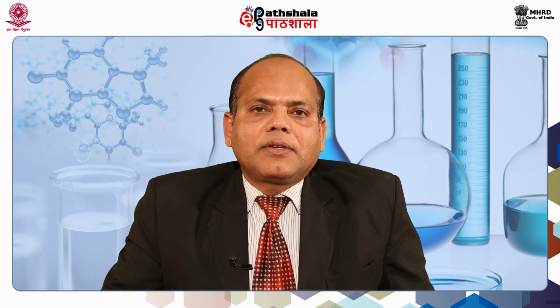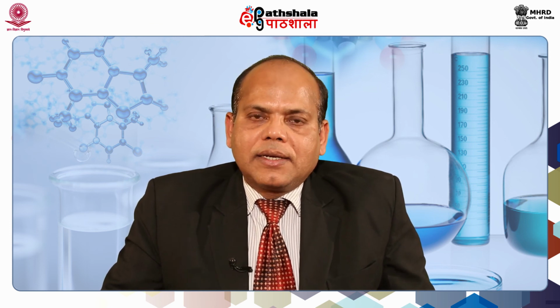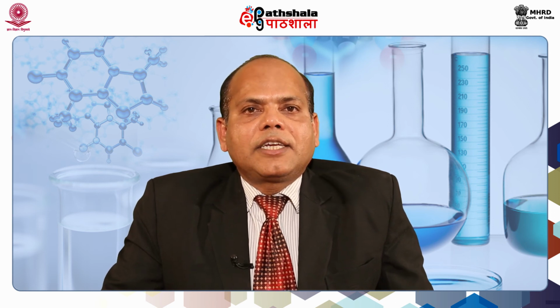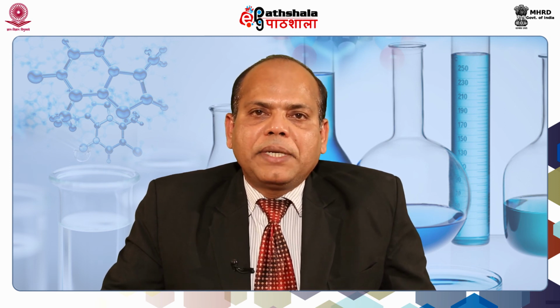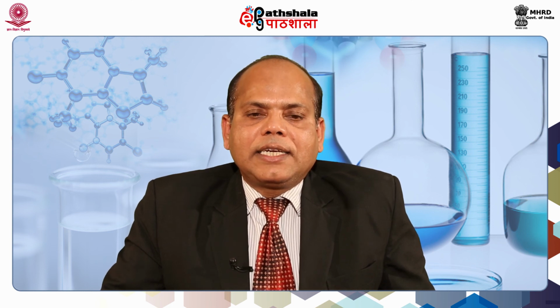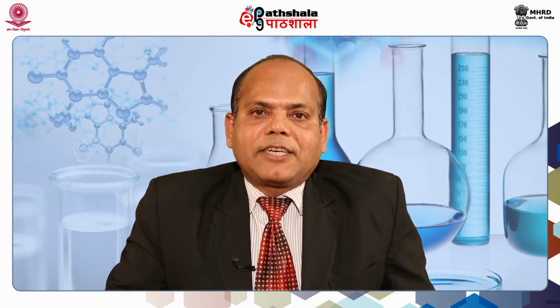These sub-molecules are introduced into the source of the mass spectrometer, and the source ionizes the molecules, and subsequently this enters into the mass analyzer. In the mass analyzer itself, the masses are determined, and subsequently it is captured by the detector, and the detector deconvolutes. From the detector, it is captured in the form of mass spectra.